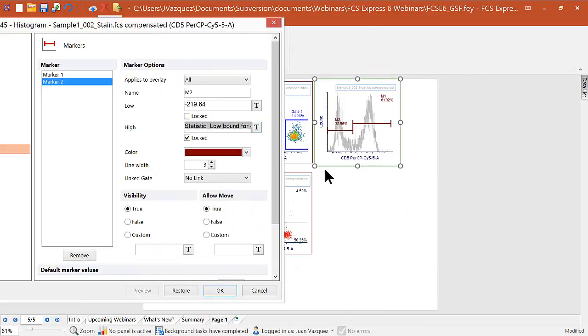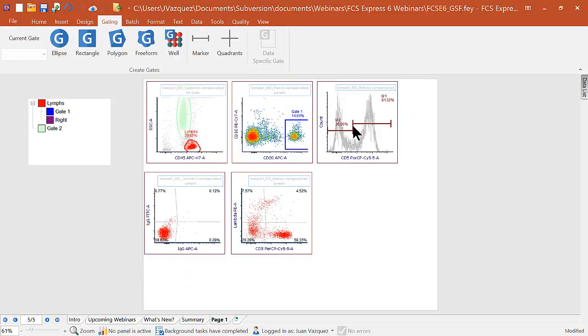If I click preview, you'll see that these two will snap. I'll lock these so that we can just move these around if we need to, and then all you have to do is move that center vertex. It's a great way to standardize and make it a little bit easier.